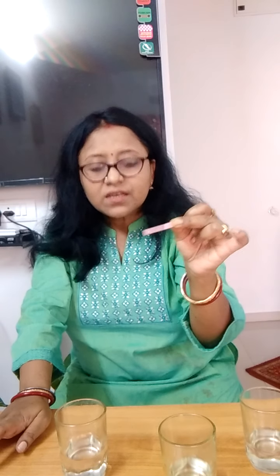So there was one question in NCERT, in CBSE: if there are 3 glasses, one having water, one having acid and one having base, and you are given one litmus paper, how would you identify which is what? Now I will do another experiment with blue litmus paper. So these 3 glasses, I will mix them up and put them here and there, and I myself don't know which glass is which, right? Now I will do the same experiment but only with one litmus paper, that is the blue litmus paper.